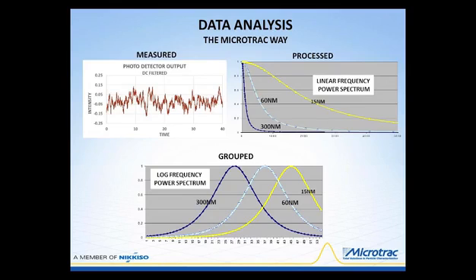And then this is summed up over all the particles that are being measured. And so the resulting distribution of frequencies says that the smaller particles are moving more rapidly and have a higher average velocity and therefore a higher average frequency shift. And then as you go up in size, that frequency shift gets smaller and smaller as the particles move slower and slower.